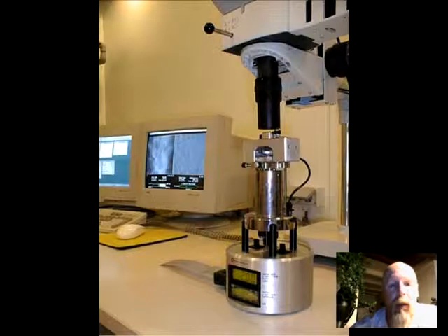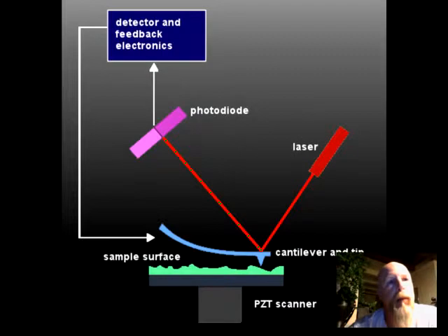You could see the imaging monitor to the left of it. This is a stepper, which has basically a stage, a piezoelectric stage, and the cantilever looks like a little square box on top of a cylinder there in between the microscope lens. Inside that box is where the cantilever and the probe actually exist. The stage itself moves in this particular image right here. But we're going to move on to our next slide, which should be this one right here.